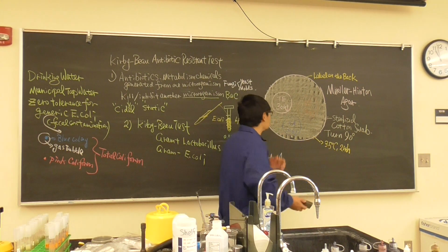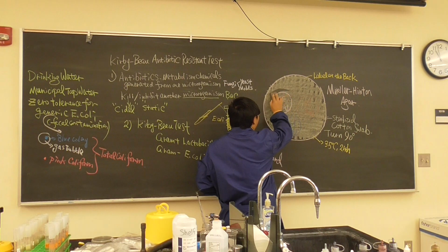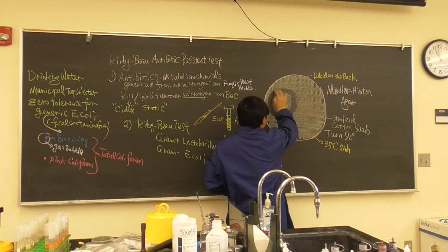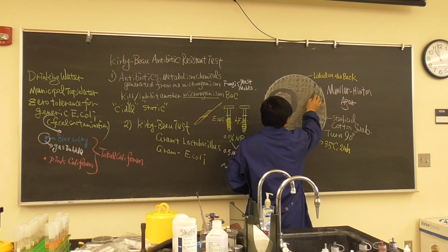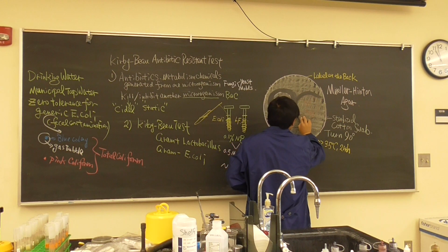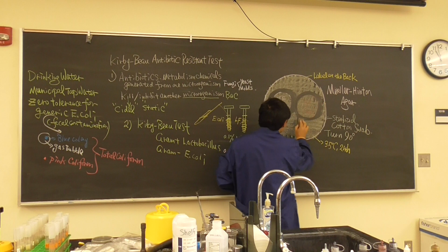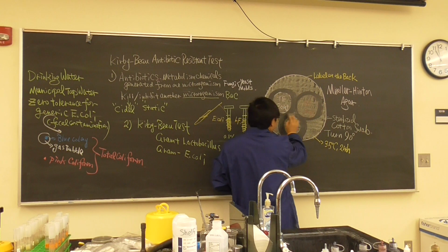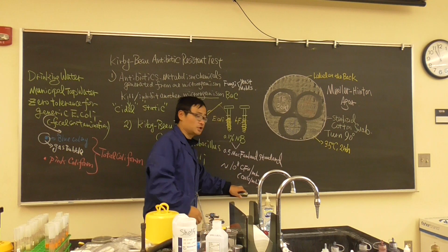So what are you going to see? You will see, more or less, a transparent zone. Something like this, maybe a little bit small, and there could be something huge. That transparent zone is the inhibitory zone.